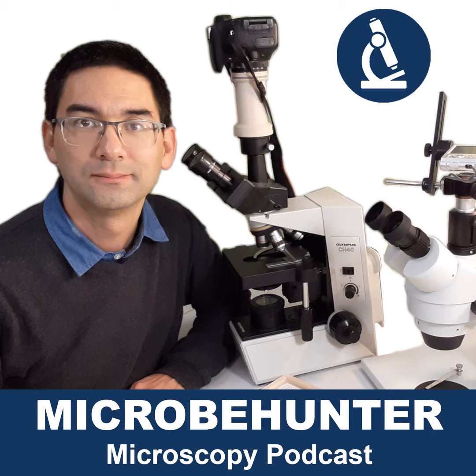So what I'm going to do now is count down all of those 10 problems in no specific order. I'm not going to rank them here, but I think that if you are able to identify these problems, it's going to make microscopy, of course, much easier for you. So we're going to start off with problem 10, and we're going to be counting down all the way to problem number 1. So problem 10 is starting to observe a slide with a high power objective.